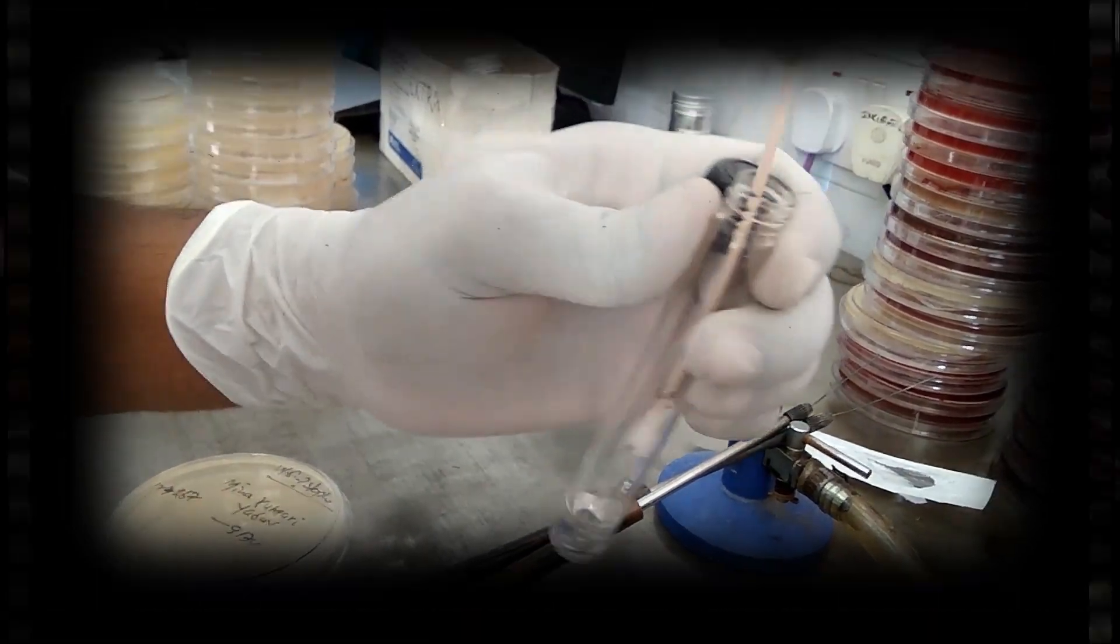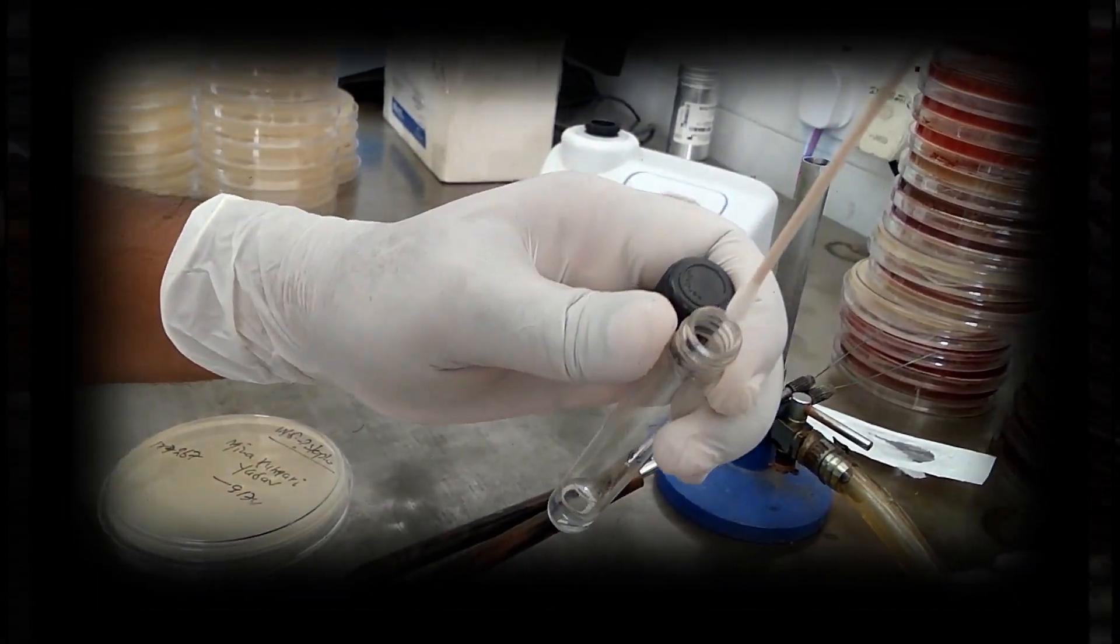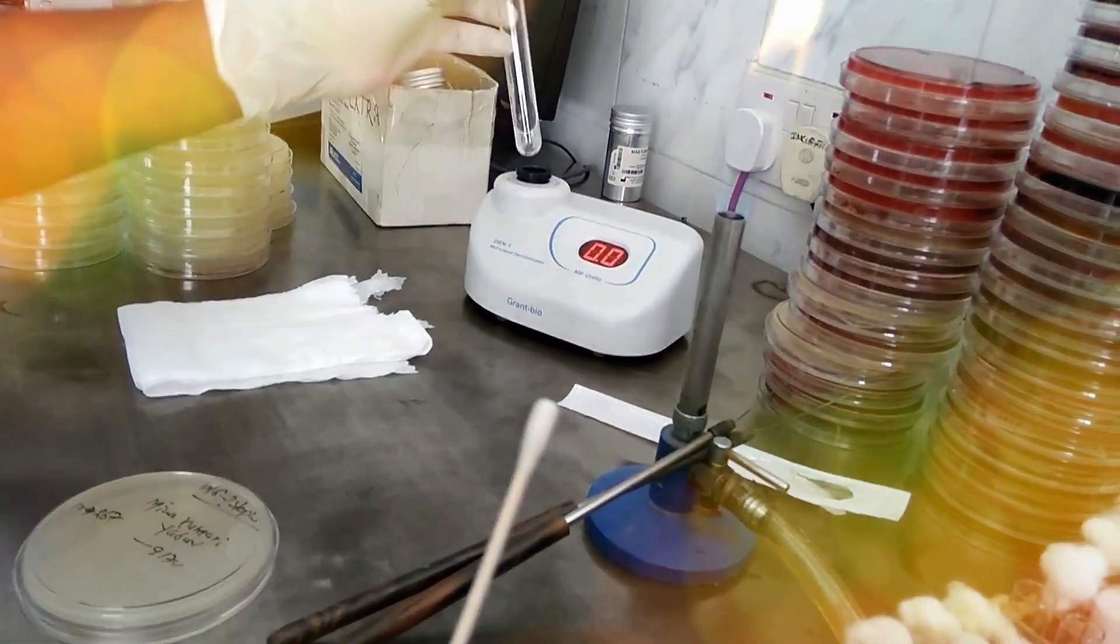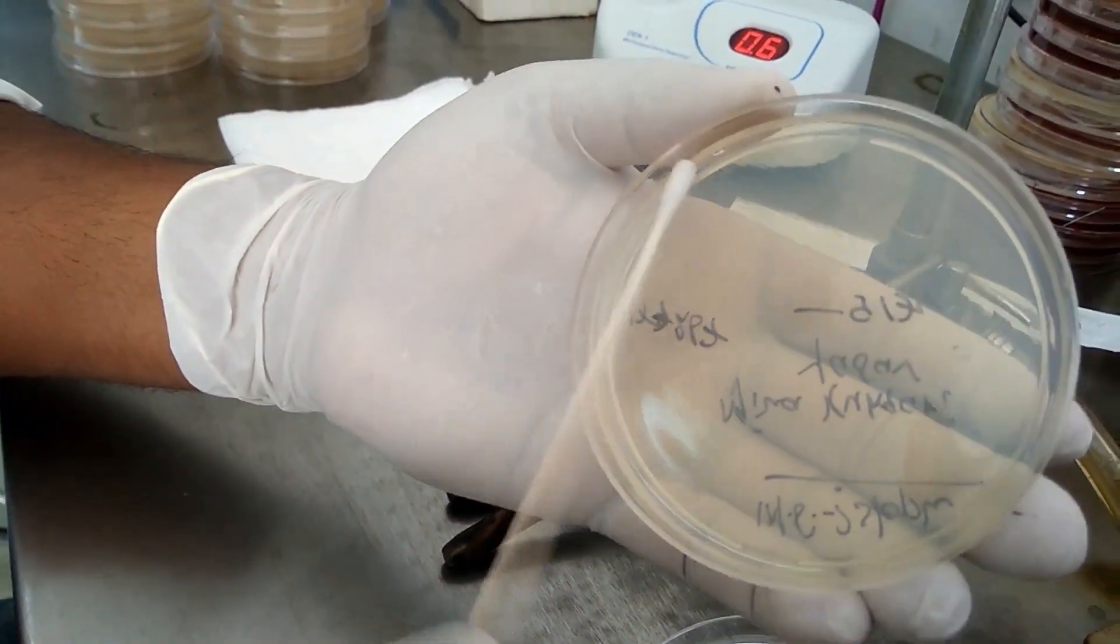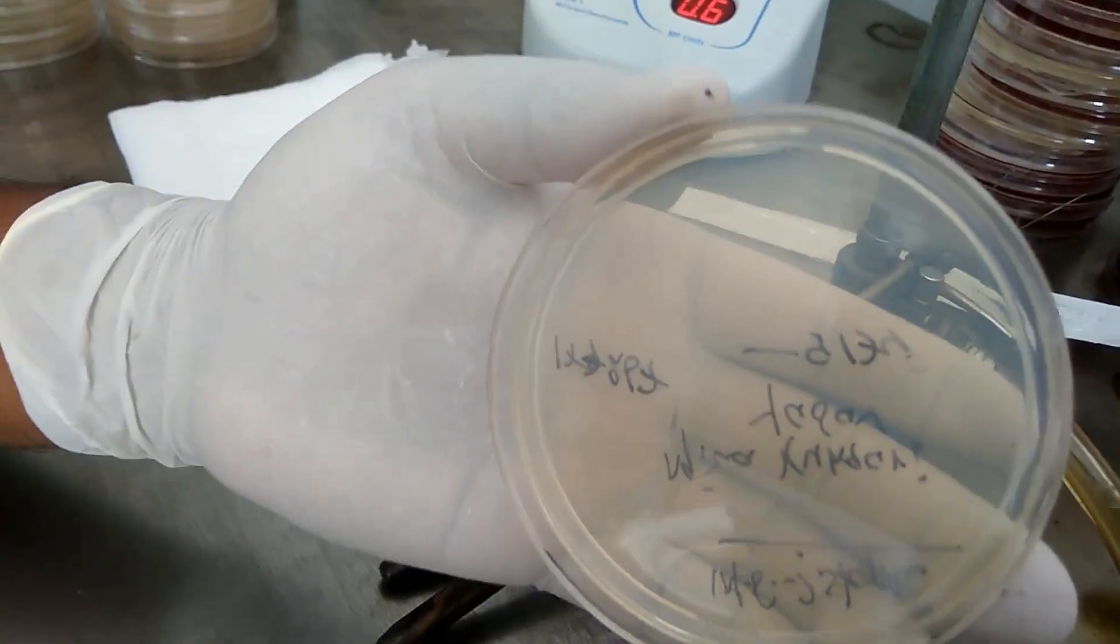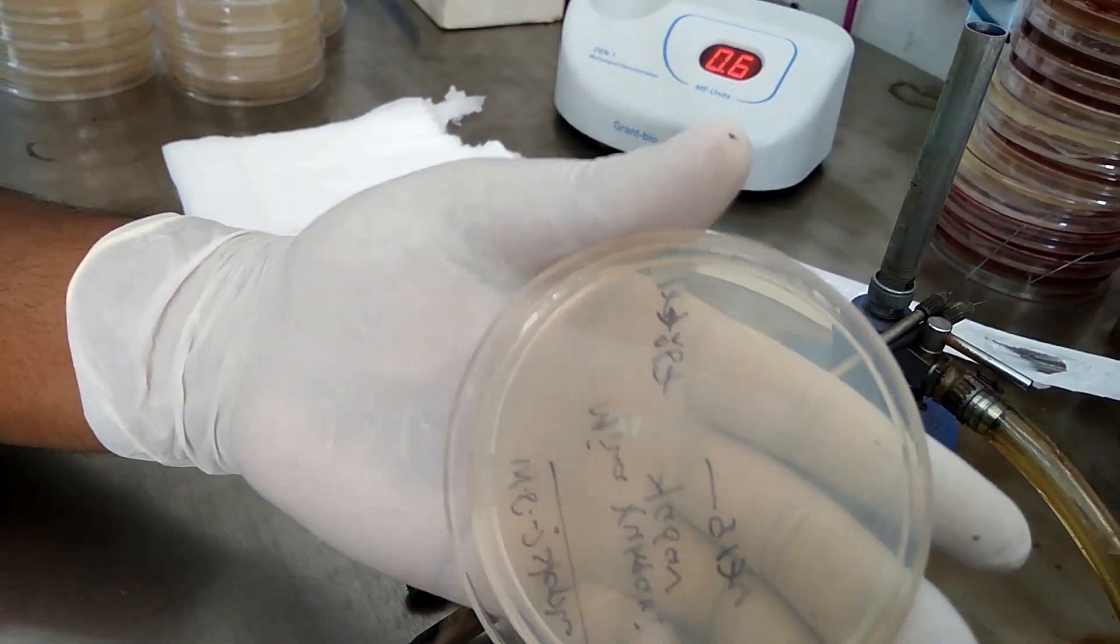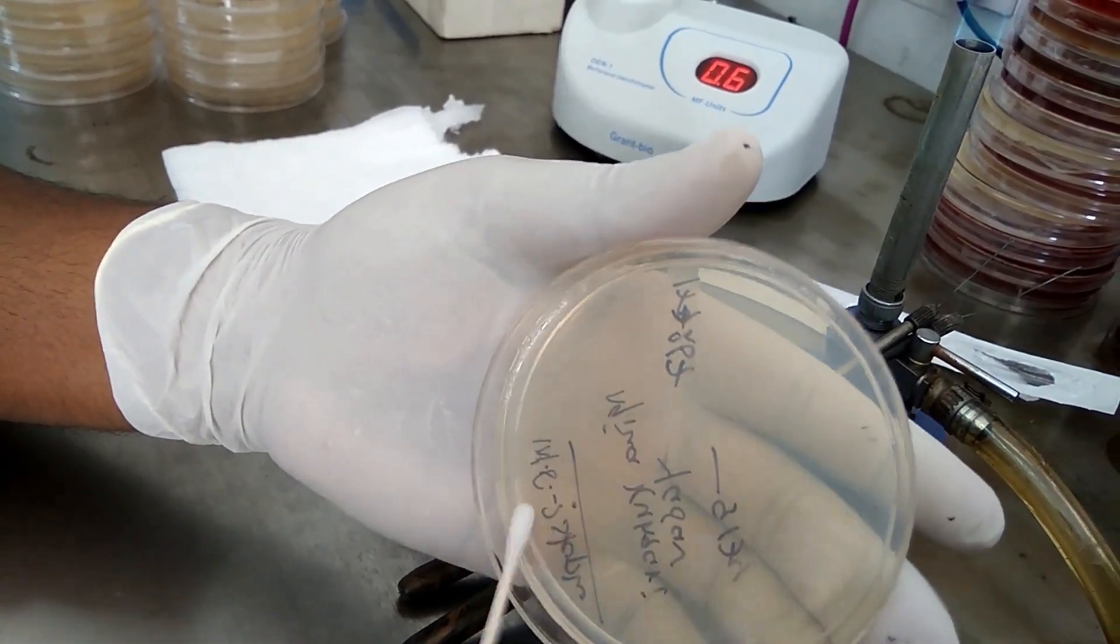Lawn cultures are obtained by flooding the surface of the plate with a liquid culture or suspensions of the bacterium. As shown here, the culture plate is kept for a minute and then excess material is poured off.